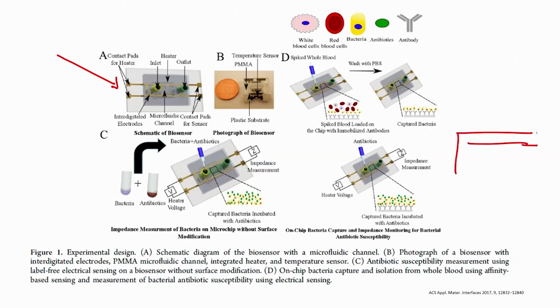Electrodes like this, correct? They are not attached, not connected. So, what is it having? It is having a heater, right?